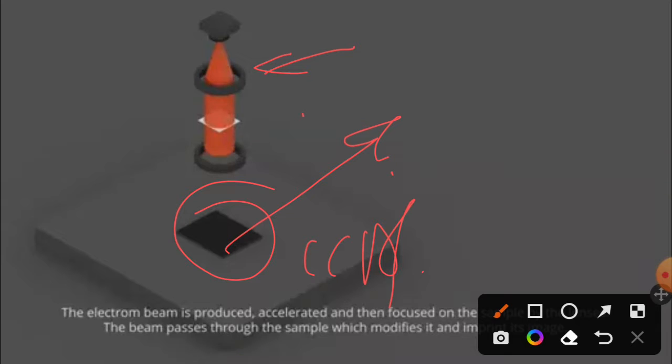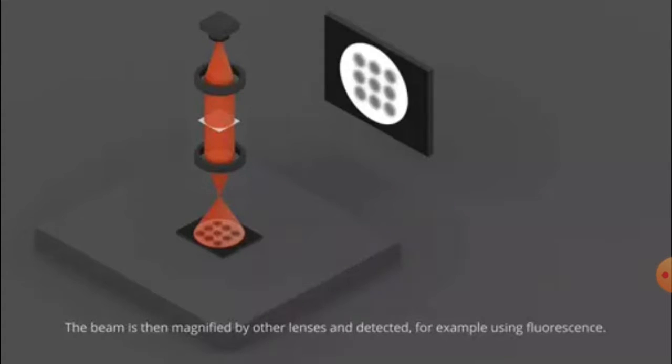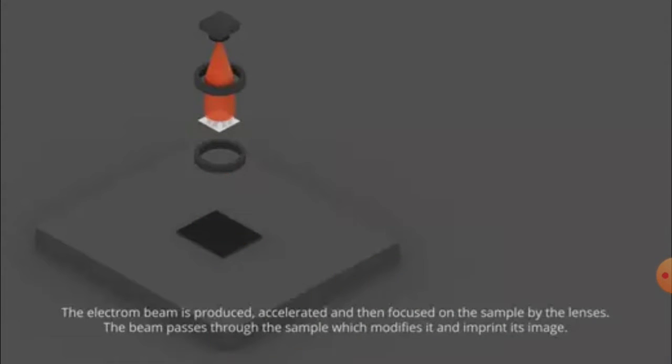Okay, and the advantages are that it provides a very high magnification, near about 1 million times. The images are detailed and resolved, and it also provides detailed structure, shape and surface structure, right?